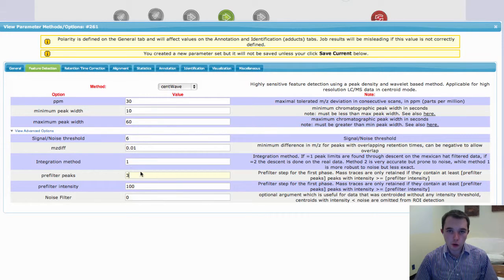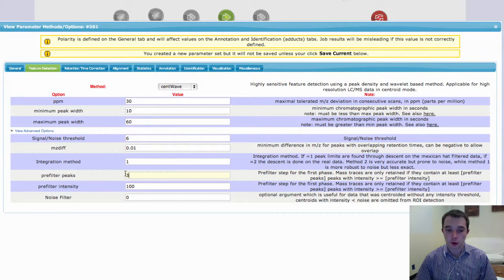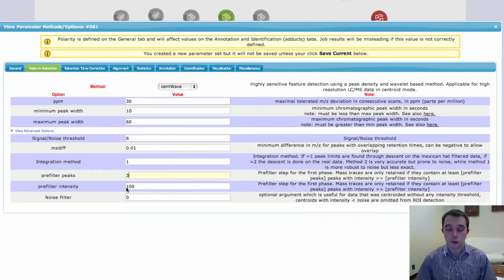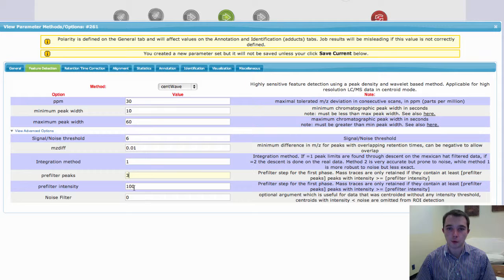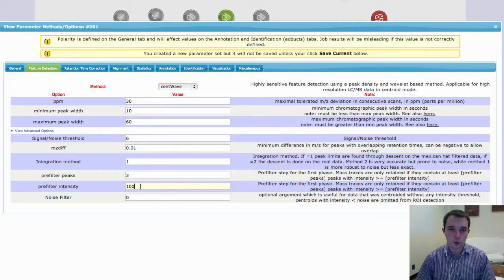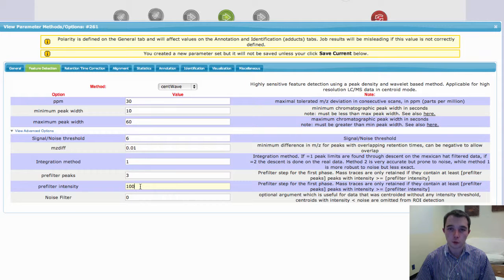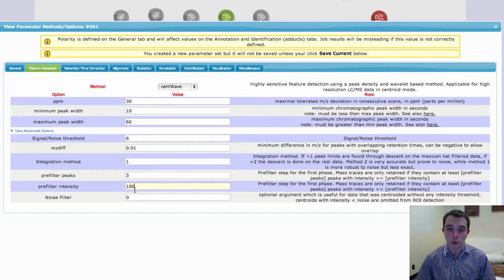Now again, you can make this longer depending upon your scan rates, and you can make your intensity higher or lower depending upon what your experiment is like. This is quite a good way to cut out any noise that you might be seeing. If you're seeing a lot of noise in your data sets, simply set this value just a little bit higher.